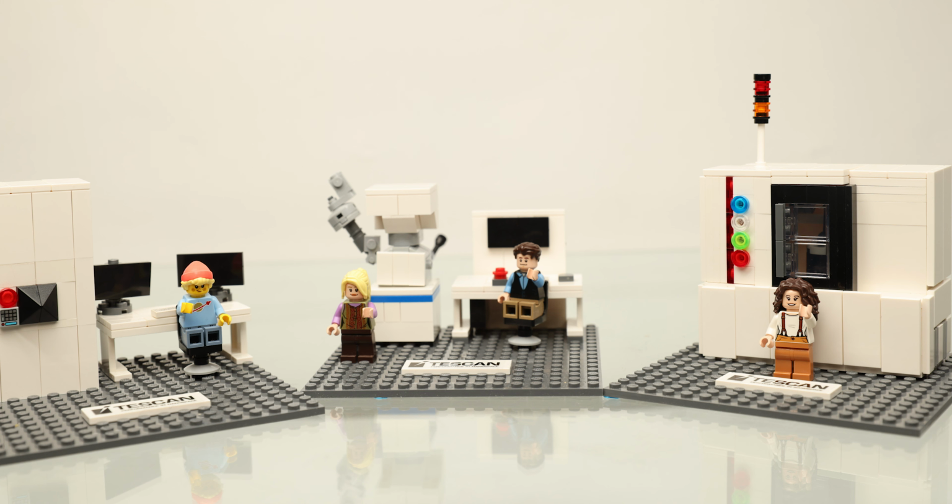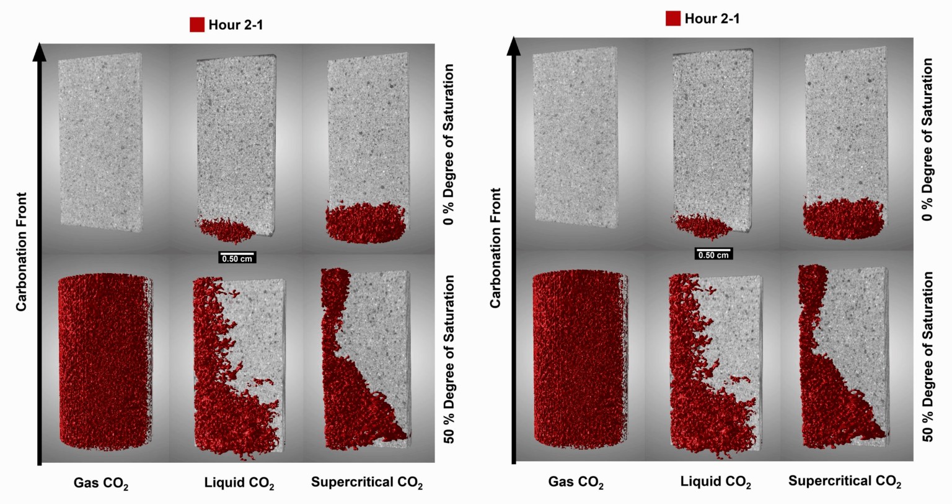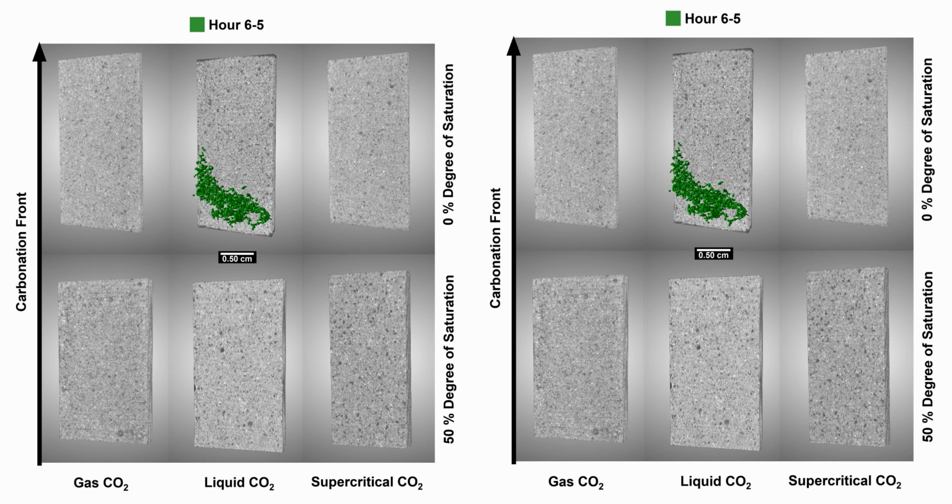The X-ray micro-CT machine allows us to understand the materials that build up the world around us and see how these structures form, break down, and evolve over time. By observing the evolution of the microstructures, we are learning how to design and build more adaptable structures for our ever-changing world.